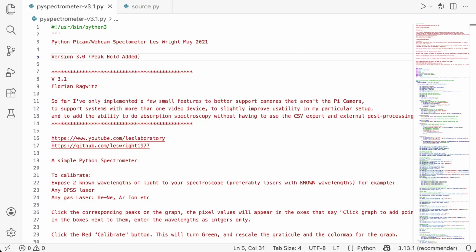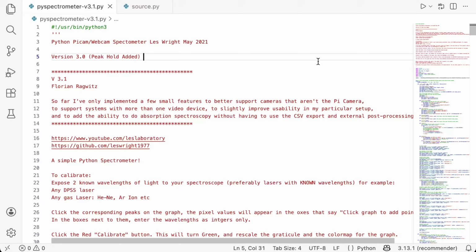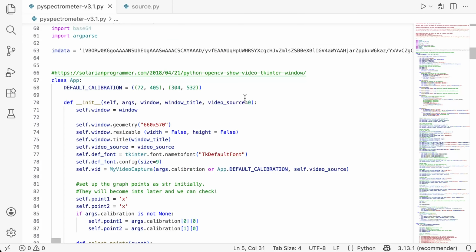and for this project I will use this PySpectrometer code. First, as we know, the spectrometer has a camera inside, so this application is just reading the data using OpenCV. So in the system, the spectrometer is visible as a camera, and the first thing I need to do is set my video device. First, let's see how it is implemented. And as we can see, it is easy.